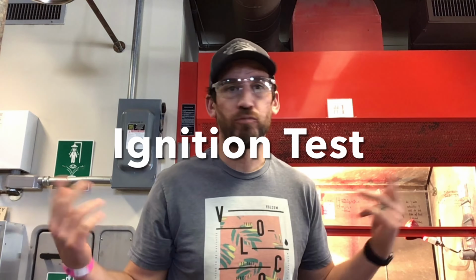Okay, the ignition test, I'm not gonna say it's lame because you get to light stuff on fire, but it's not super instructive. If you burn your sample with a spatula and you get a yellow, smoky, sooty flame, that means you probably have an aromatic species. If it's not sooty, with no black smoke, then it's not aromatic. But sometimes you could have something that might be aromatic, so you might want another means to confirm. But it is kind of obvious, so you'll see.